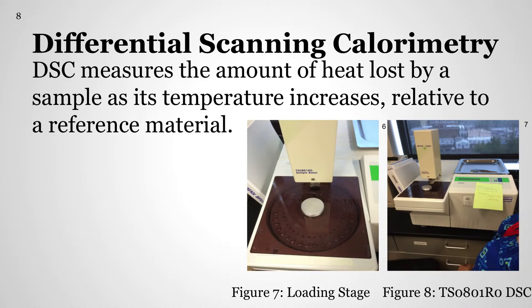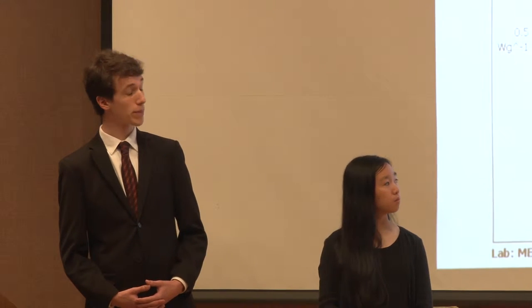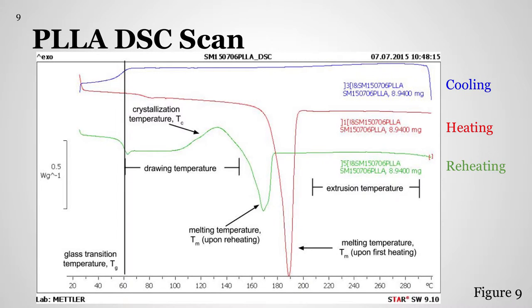Differential scanning calorimetry, or DSC, the first characterization technique that we used, essentially consists of heating, cooling, and then reheating a sample, all the while recording the amount of energy the sample emits relative to a given standard. Through this, the temperatures at which various phase transitions in the sample occur can be determined by the analysis of exothermic peaks and endothermic valleys in the sample's DSC scanning curve. In this PLLA DSC scan, one sees in red the initial heating, in blue the subsequent cooling, and in green the final reheating.